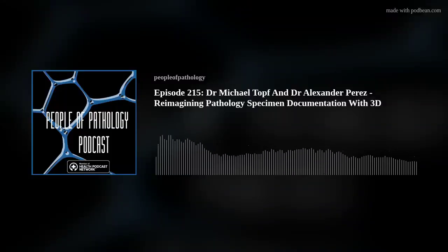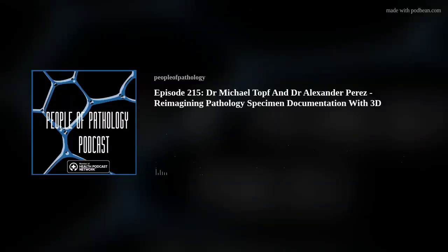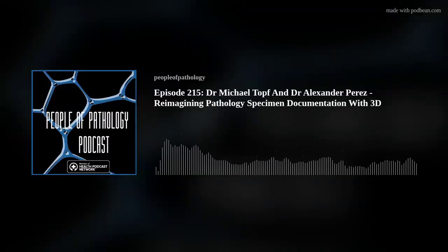Okay. And then we kind of covered this already, but conventional 2D photographs, like the ones we use where I work, often fail to capture the full geometry of the specimen. The shapes of these specimens are very irregular and not typical sometimes. And I wonder then, for 3D scanning and 3D mapping of the specimens, how is that going to increase the diagnostic accuracy and communication, not only back to the surgeons, but maybe to the patients too, especially for things like margin status? So I think a 3D model, if a picture is worth 1,000 words, the 3D model, I'm not sure how many words it's worth, but it's worth more than 2 pictures or however many pictures you're taking to gross the specimen.